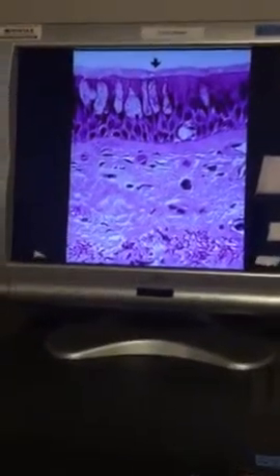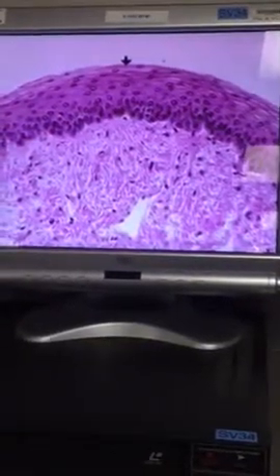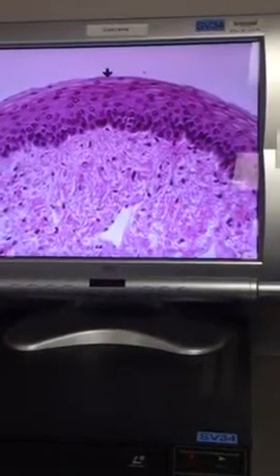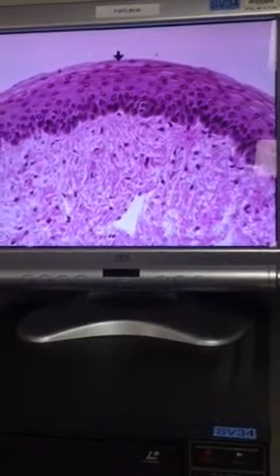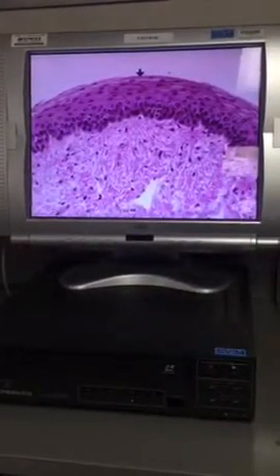Okay, so let's take a look at something else. Notice it looks like many layers of cells, right? So this is a stratified epithelium. You guys have two types. It's on the outer skin. Close. This is actually the same type of tissue as the epidermis, almost. This is non-keratinized. So this would be stratified squamous from inside the body. This is actually from the esophagus.